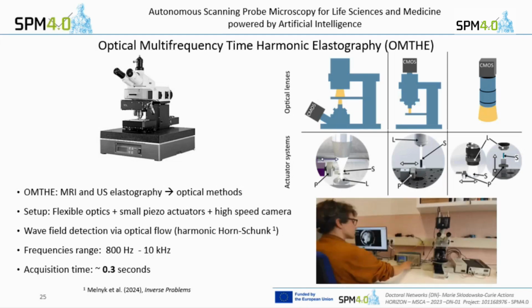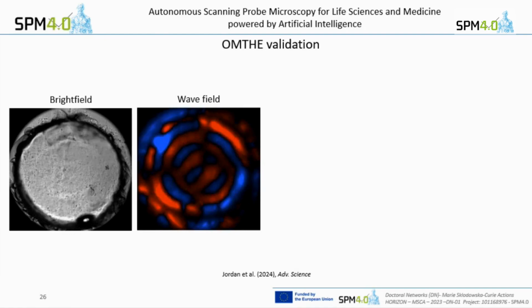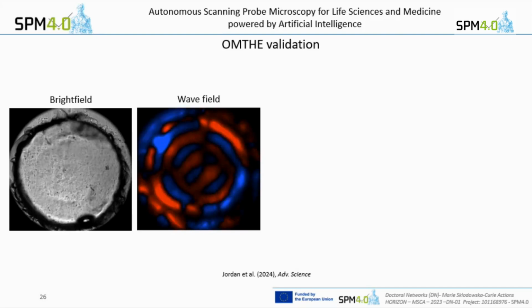Here you can see Jakob Jordan, who was basically the brain behind this method, performing a measurement. Unfortunately, the sound is not working. You would have heard a short beep, and that's it. Multi-frequency sweep in less than a second. He was measuring biofilms. You can see synchronized wide field images, and you can see here some movement. After analysis, you can see wave fields. And this you can then analyze for mechanical parameters.